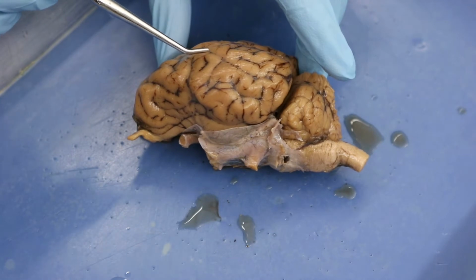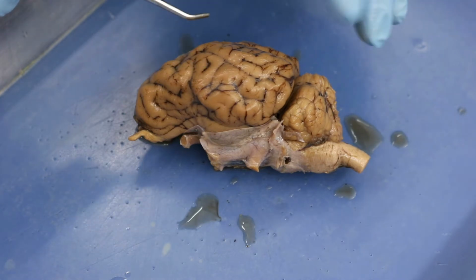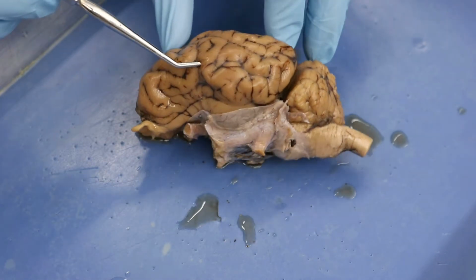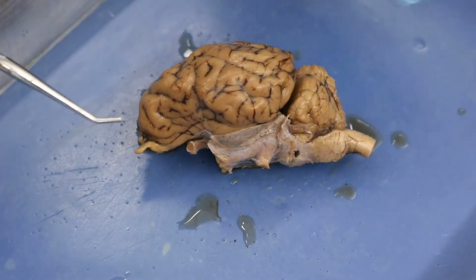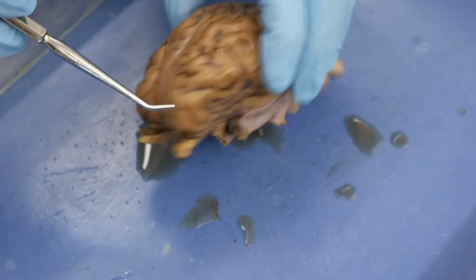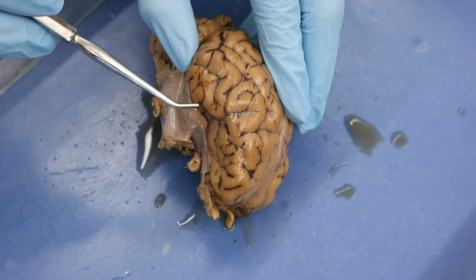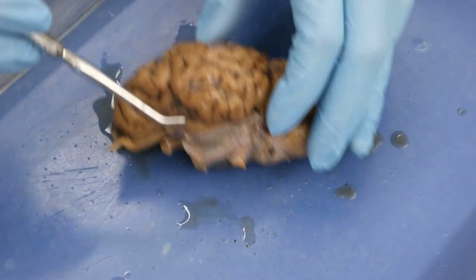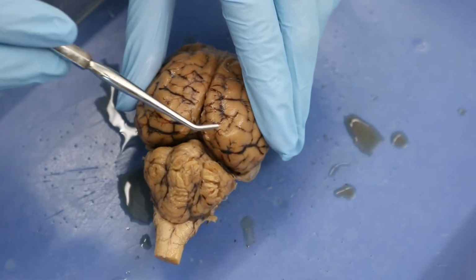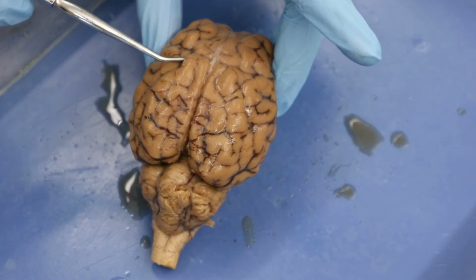So essentially what we're going to do first is a view of the external features, then we'll go ahead and dissect our brain, and then we'll look at the internal features, okay? So first off, we have the cortex up here. The anterior portion of the cortex, of course, is your frontal lobe. Then you're going to have 2 parietal lobes on either side, and a temporal lobe over here, a temporal lobe over here, and your occipital lobes are going to be in the back, okay? So this is all part of your cerebral cortex, okay?